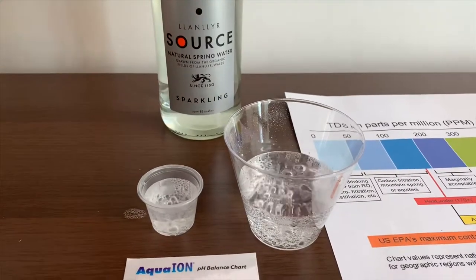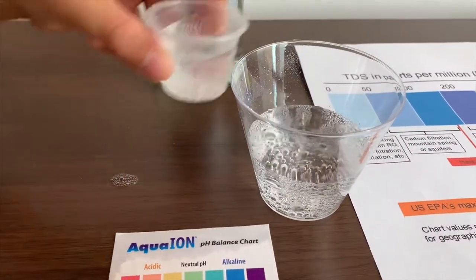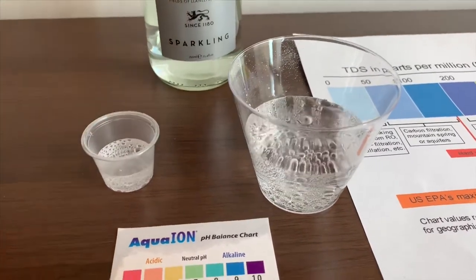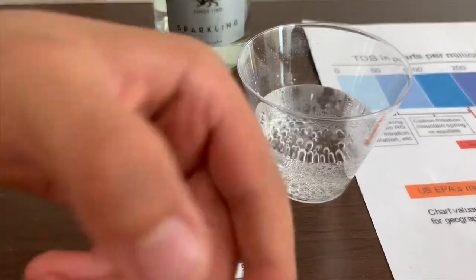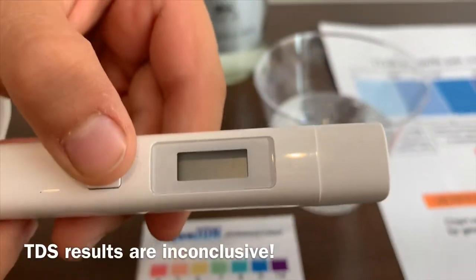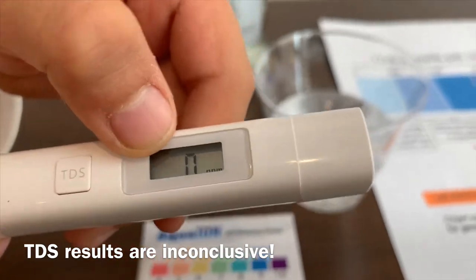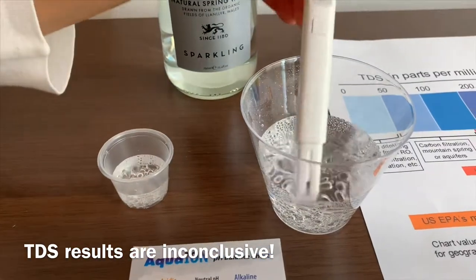This is a little too much, let's pour some back. First we're going to test the TDS level. Turn on the TDS, make sure it says 0 and put it in.